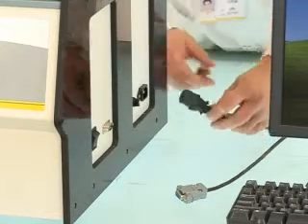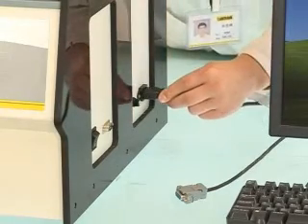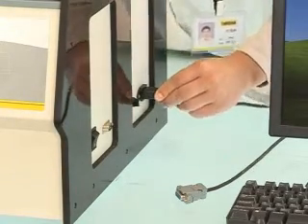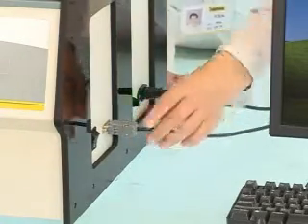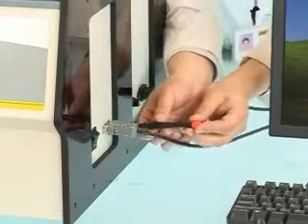Connect the mainframe and power source. And then connect the mainframe and computer. After this, use a screwdriver to tighten it.